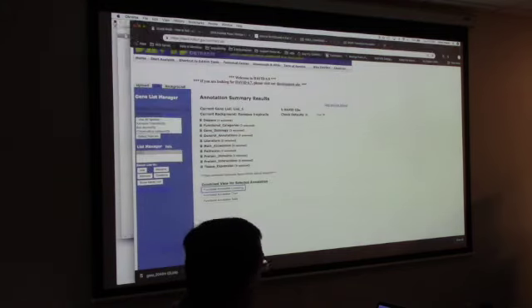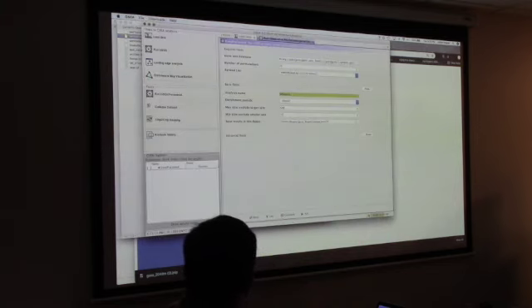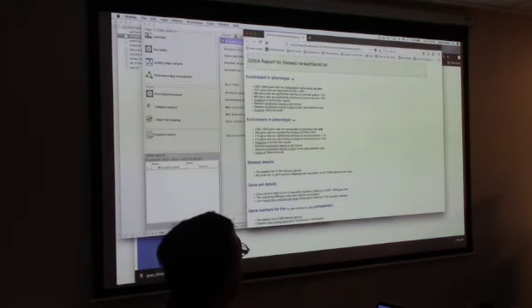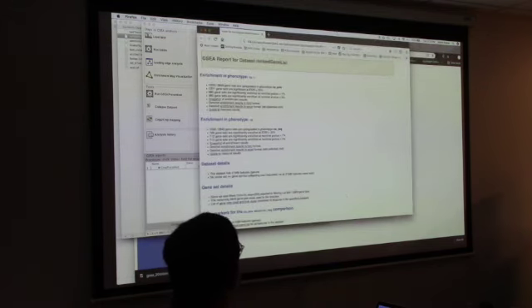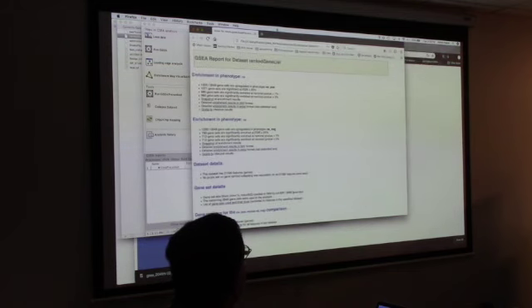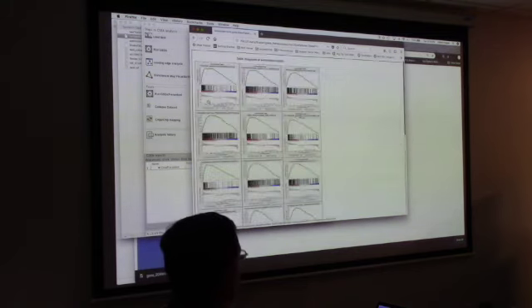All right, let's go back and look at our original thing here. Okay, so this one, it was a success. When you click success, it opens this in a browser and actually shows you. So this success is a clickable link. Just click here, and it opens a new window in your browser. And pretty much everything here is your enrichment in a simple form: these many gene sets are upregulated, these many gene sets are significant at 25% cutoff. Let's look at the snapshot.